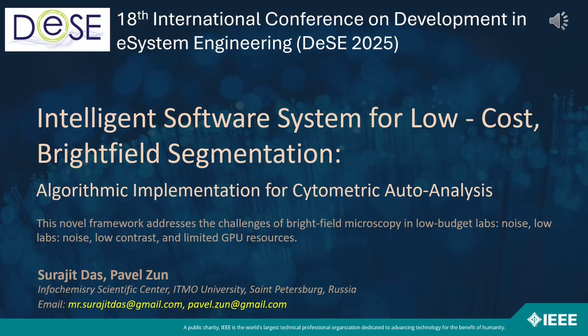Today, I am going to present an intelligent software system for low-cost bright field image segmentation. The scope of this talk is primarily focused on the algorithmic implementation for cytometric auto-analysis rather than on a theoretical algorithmic discussion.